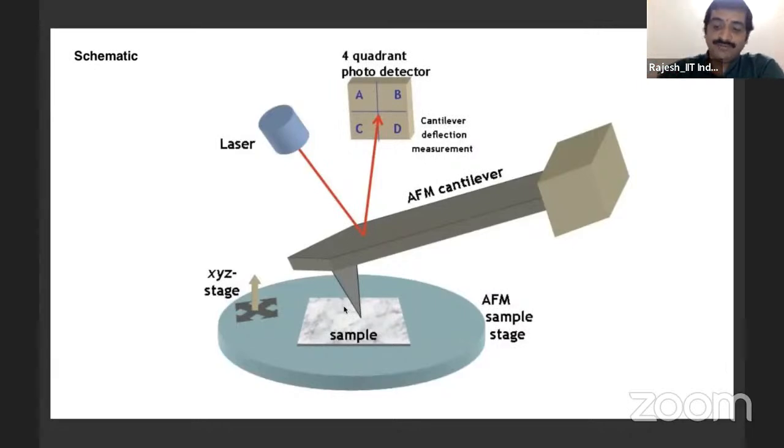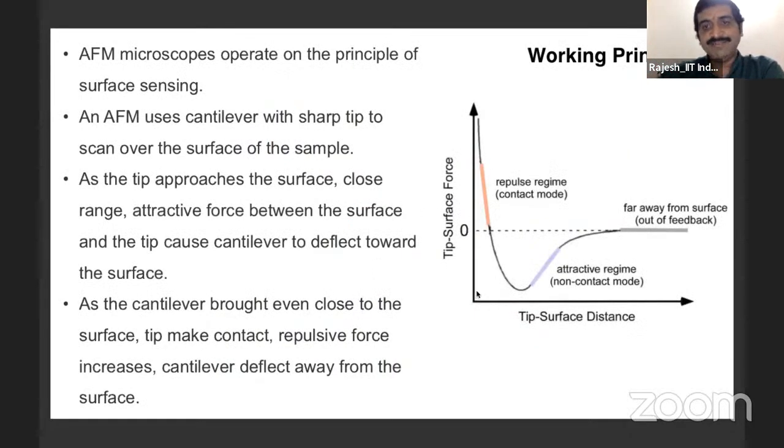Let us see this graph. Since we know that the force between two surfaces depends on the distance, right? That's the basic principle that we know.